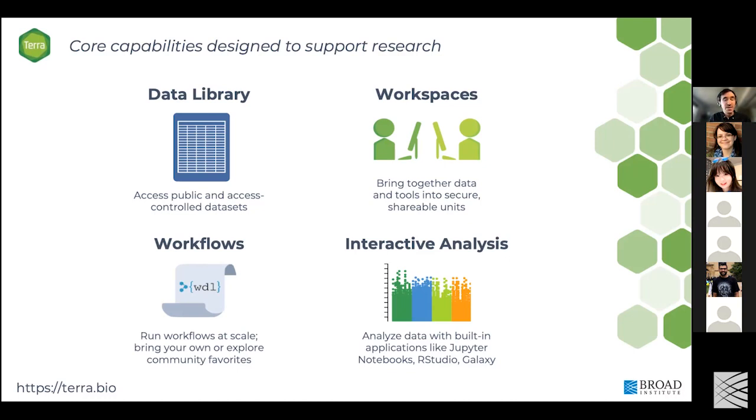We'll talk about the modes of analysis in Terra, one of the major methods being workflows, where you can bring in pipelines that are community shared from places like Dockstore or the Broad Methods Repository, or you can bring your own through the Broad Methods Repository. Terra supports the Workflow Description Language, so all the workflows we talk about today will be in the WDL scripting language.